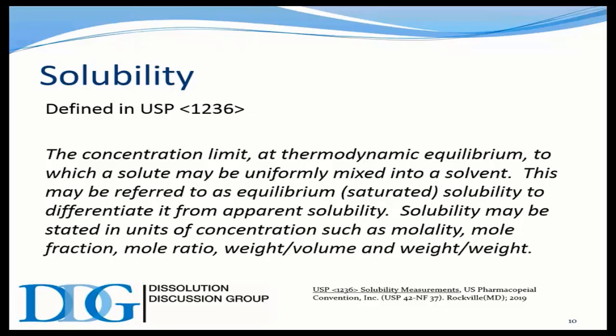So solubility is generally stated in unit concentrations such as molality, mole fraction, mole ratio, weight volume. There's a number of different ways to look at this, but it's usually some type of weight volume that we very commonly use, especially on a test that you'll see for the shake flask method that we're going to mention in a moment.